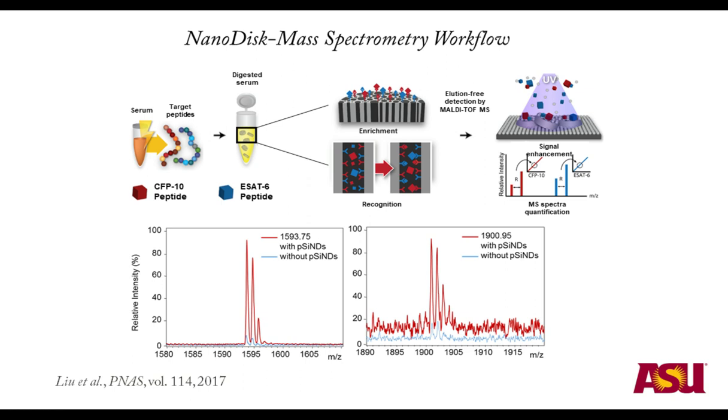They absorb the energy from the laser, preserve the energy in the nanopore, and efficiently pass that energy to the target peptide, enabling better ionization. By using the nanoparticles, we can dramatically increase the sensitivity for those peptide detections.